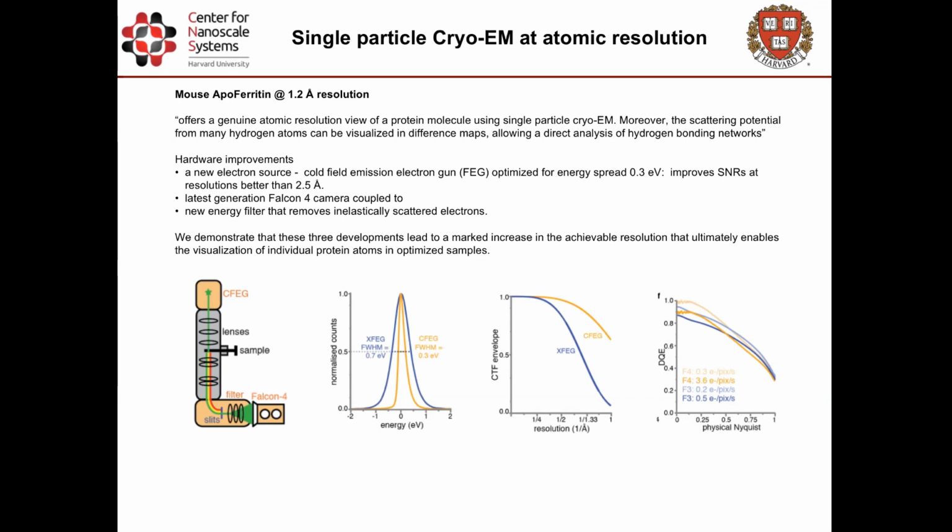The one used for the 1.2 angstrom, below 2 angstrom resolution, is expressed and purified properly, so you can really see the details. I'm not sure you can obtain this with a commercially bought specimen, but if anybody has access to this type of microscope, you're very welcome to try, and maybe we can prove we don't need so much purification to get resolution if we have good enough algorithms to select the good particles from the bad particles.